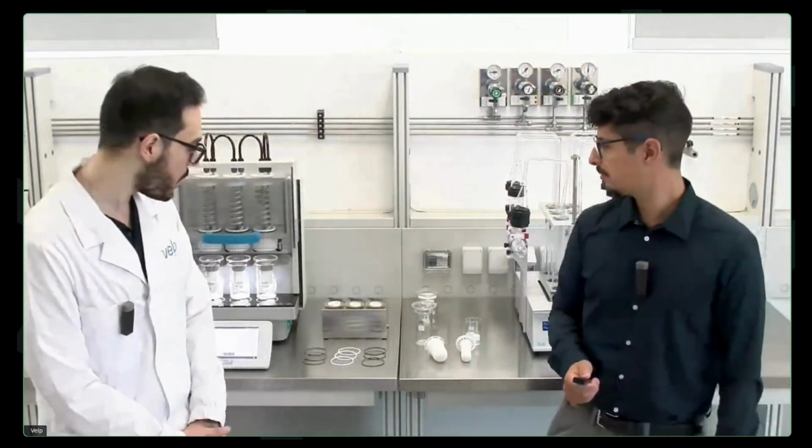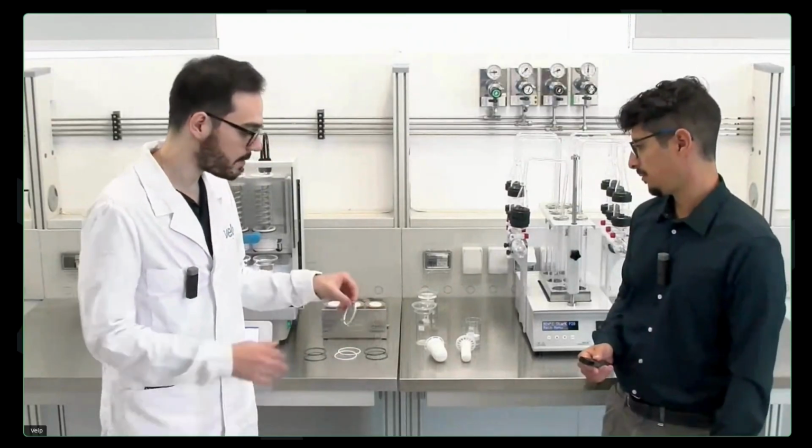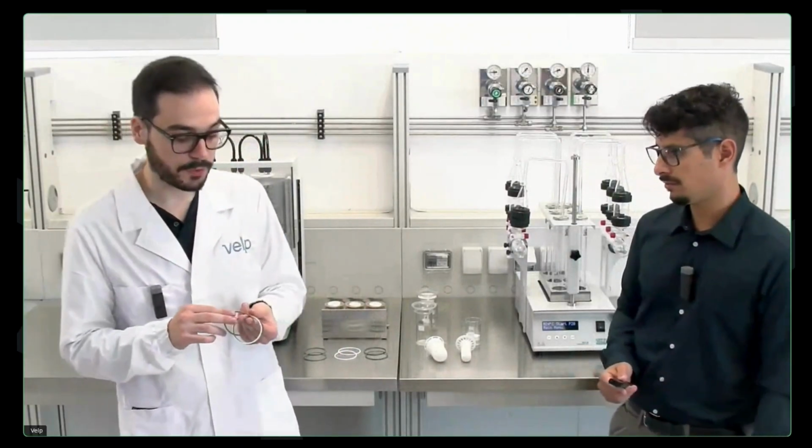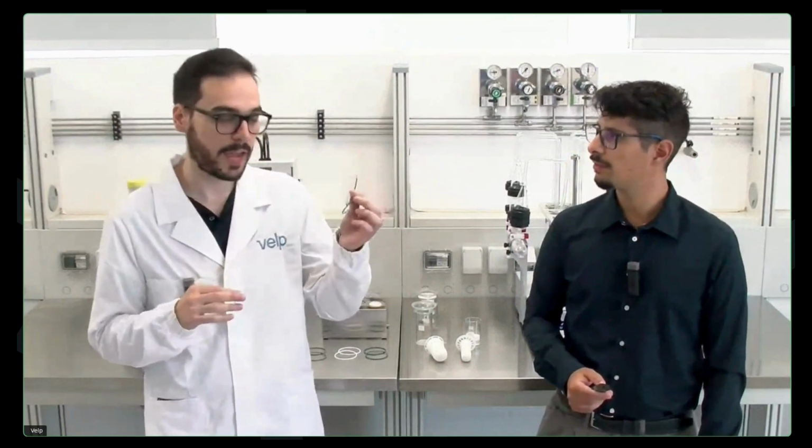Thank you for your question. We can offer 3 types of gasket. As I have shown you before, we have the gray one, the white one, and the green one. Both the gray, which is butyl, and the green one are provided with the instrument and can be used with the majority of the solvents, both with low chemical resistance and high chemical resistance.